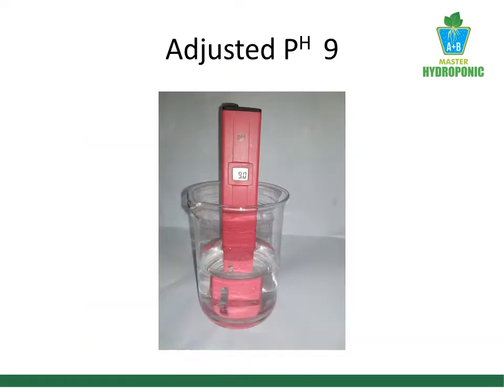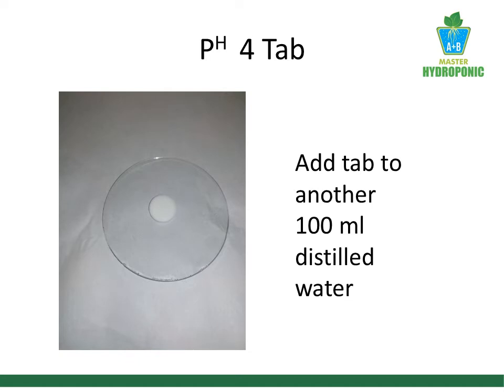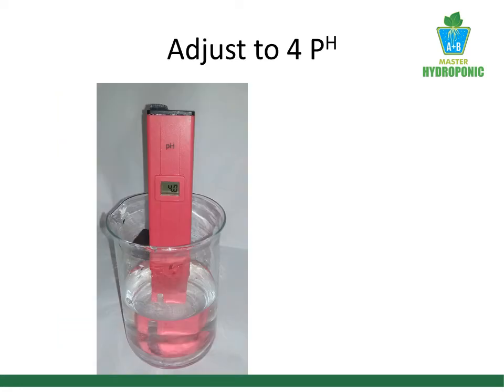Now I take a buffer tablet of pH 4 and add it to a new 100 ml of distilled water. With the calibration screw, I adjusted the pH to 4.